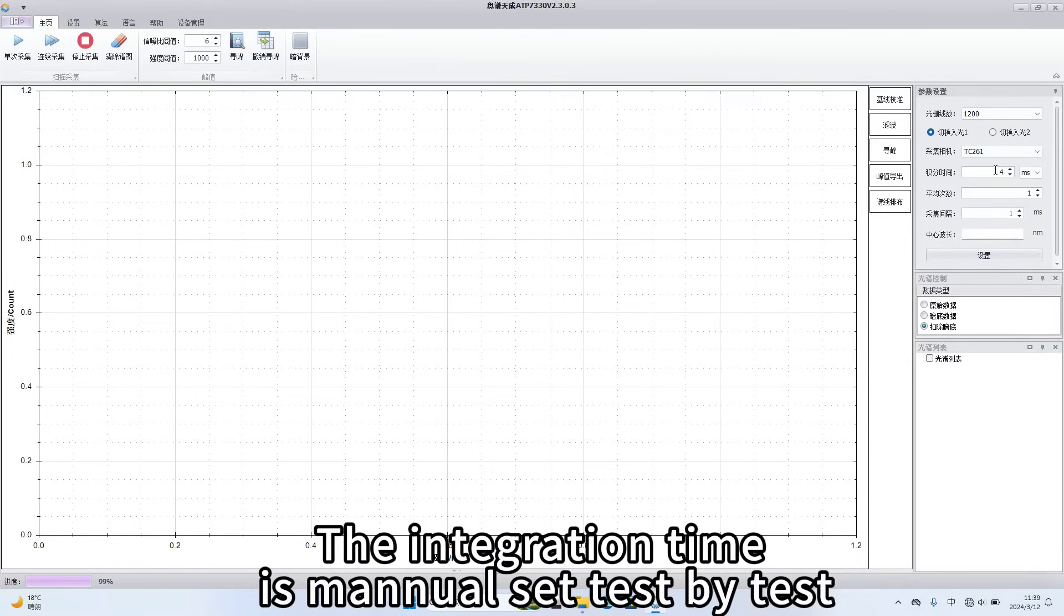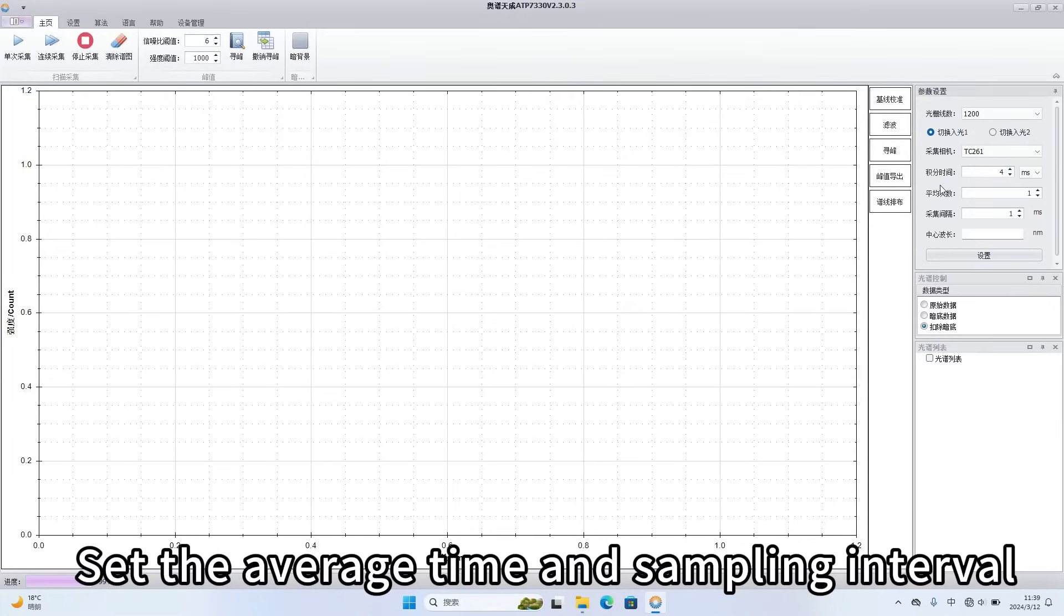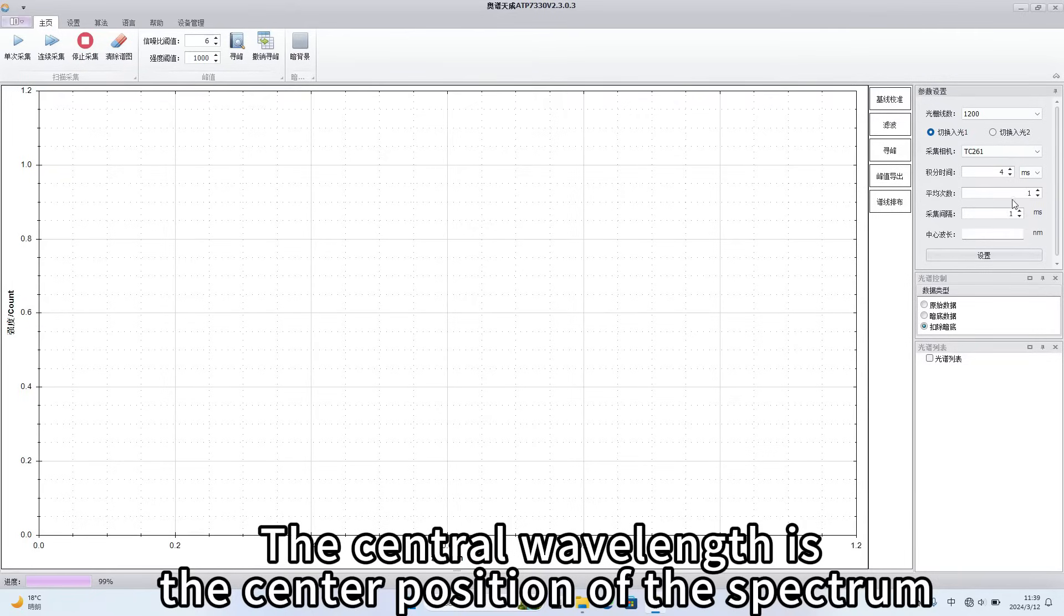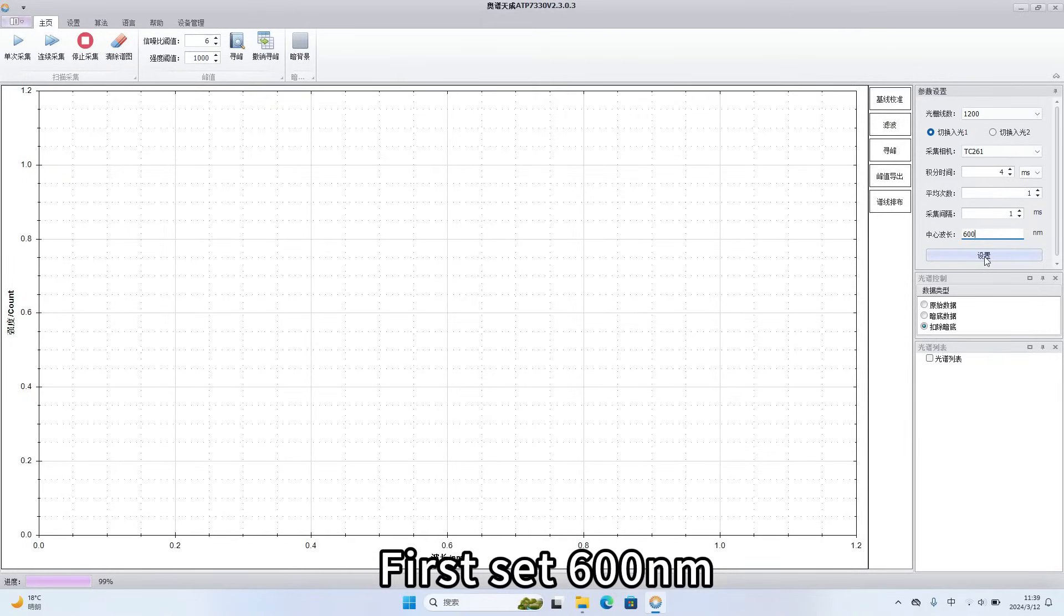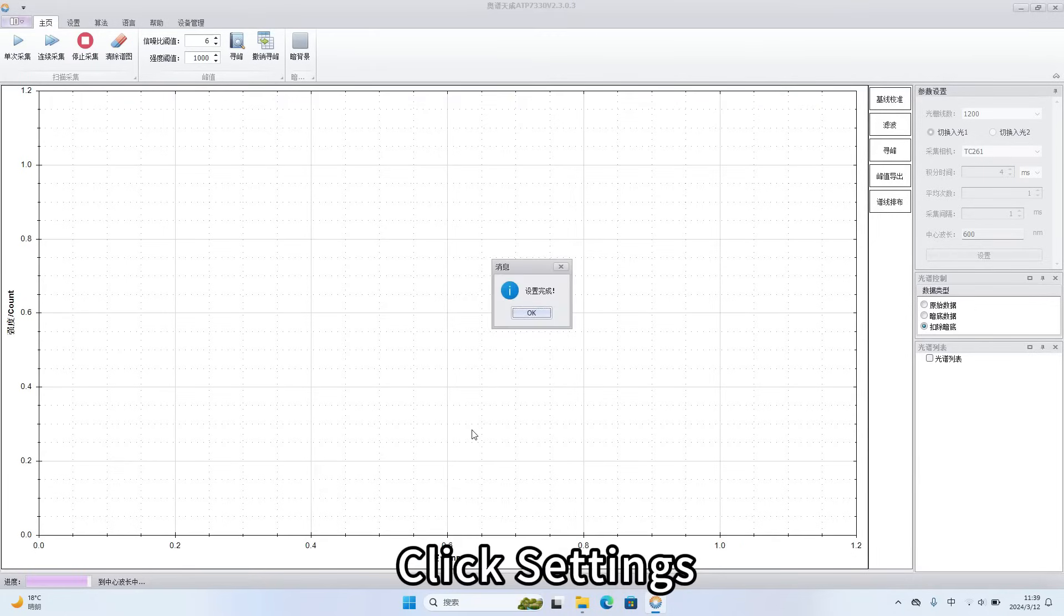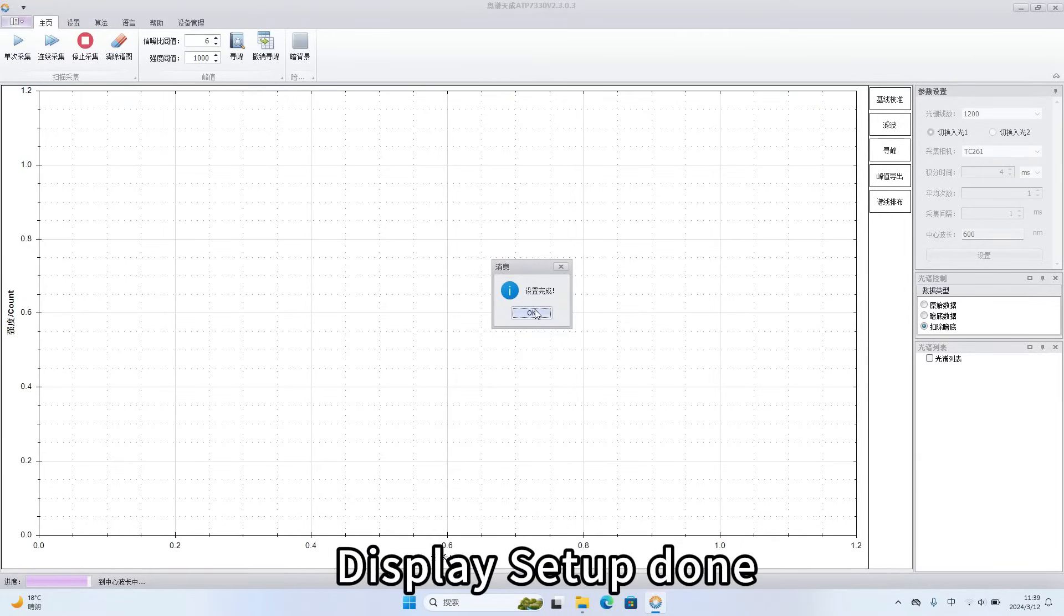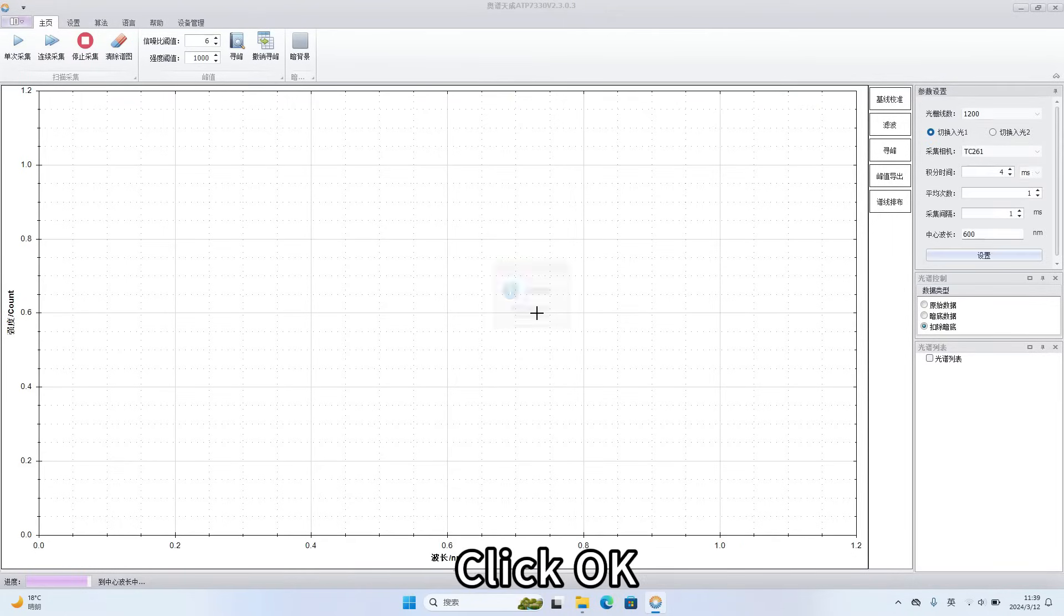The integration time is manual set test bite. Set the average time and sampling interval. The central wavelength is the center position of the spectrum. First set 600 nm. Click settings. Display setup done. Click OK.